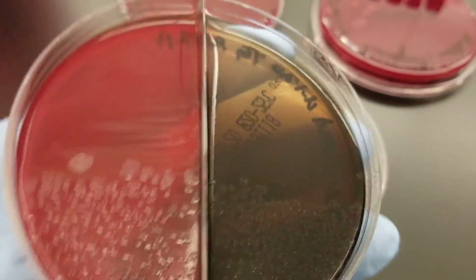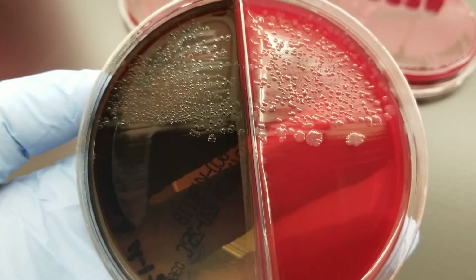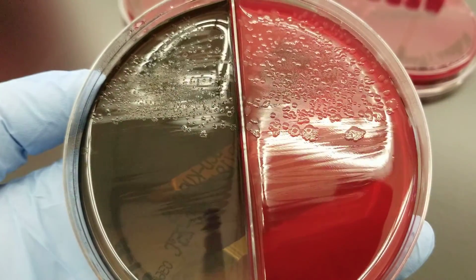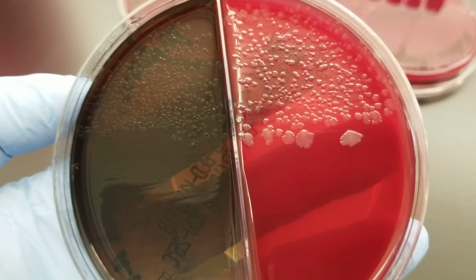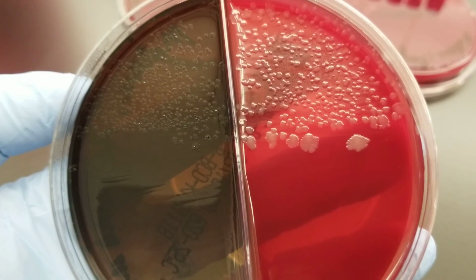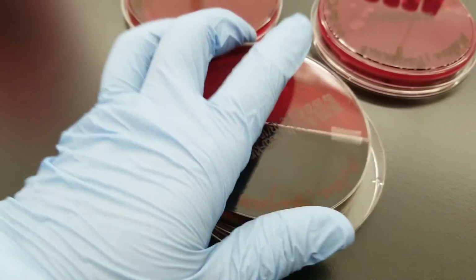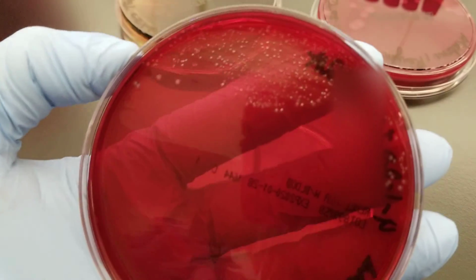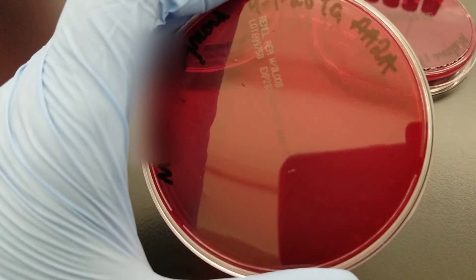We have the BBE on the left side. It's blackened, which is an indication or a preliminary identification of Bacteroides fragilis. We have growth on the LBKV, and this is after I had left this in the incubator for a while so that we did see absolutely beautiful growth. So you would not get this great of growth within 24 hours. Okay, and then we have growth here as well. That was the PEA agar.